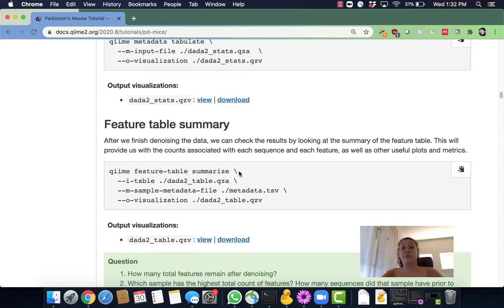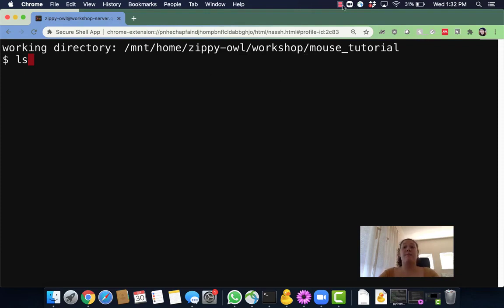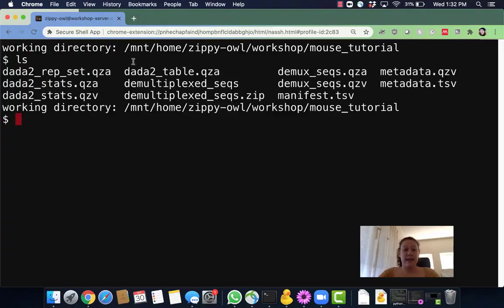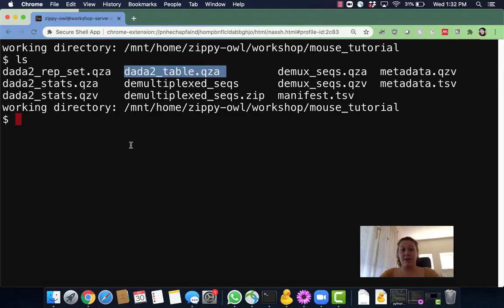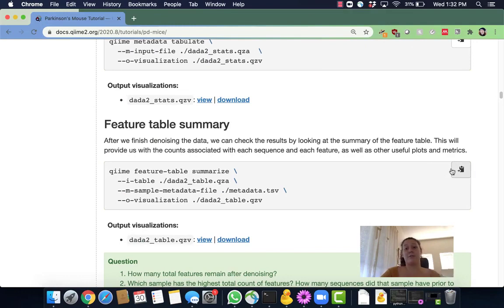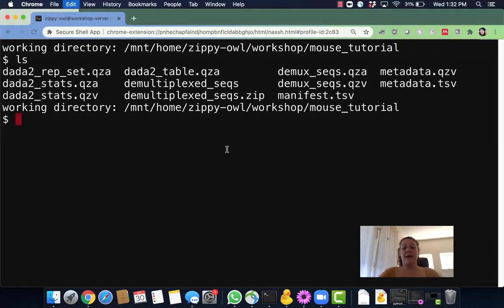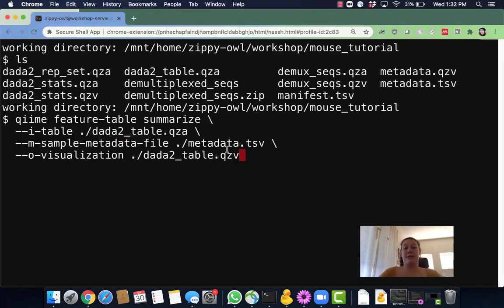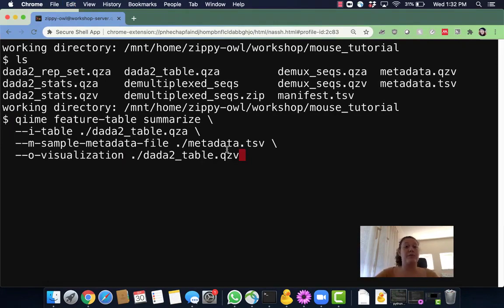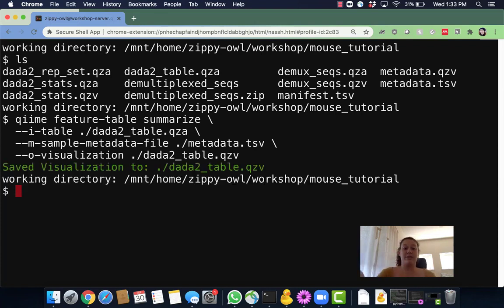Let's head on over to our command line and make sure that we have everything we need. I'm going to ls in my working directory. My working directory is my workshop directory and then inside that workshop directory is the mouse tutorial. So I'm going to ls and what I really need to make sure I have is this DADA2 table.qza file. If I don't have that I can't run this command. Now I'm going to copy from this little clipboard our command for running feature table summarize and we're going to paste that right in there. We're going to be running the feature table summarize. Our input is going to be the DADA2 table.qza. We're going to input our metadata and we're going to output a visualization. This should only take a couple of seconds and once we have that we will have our visualization.